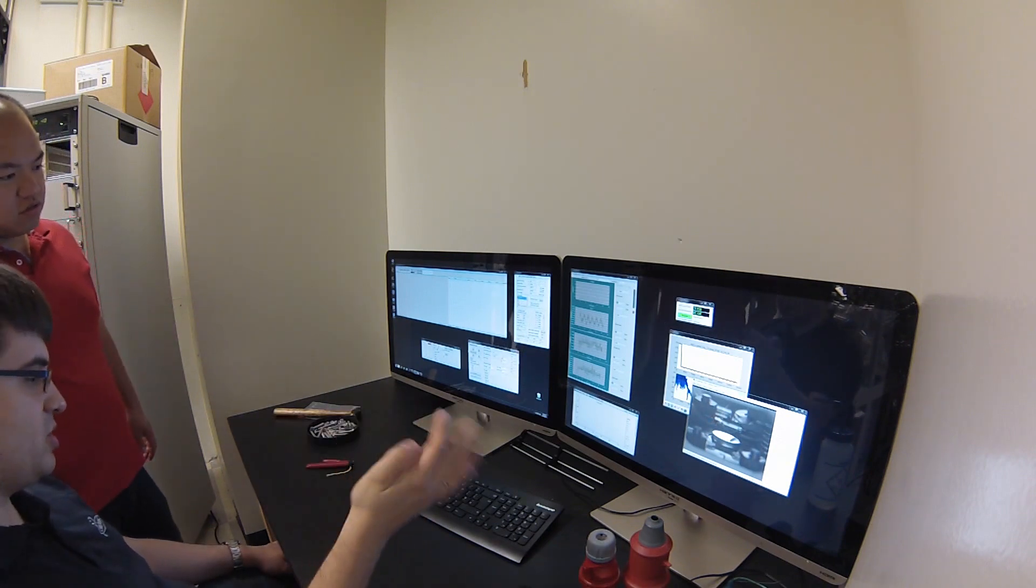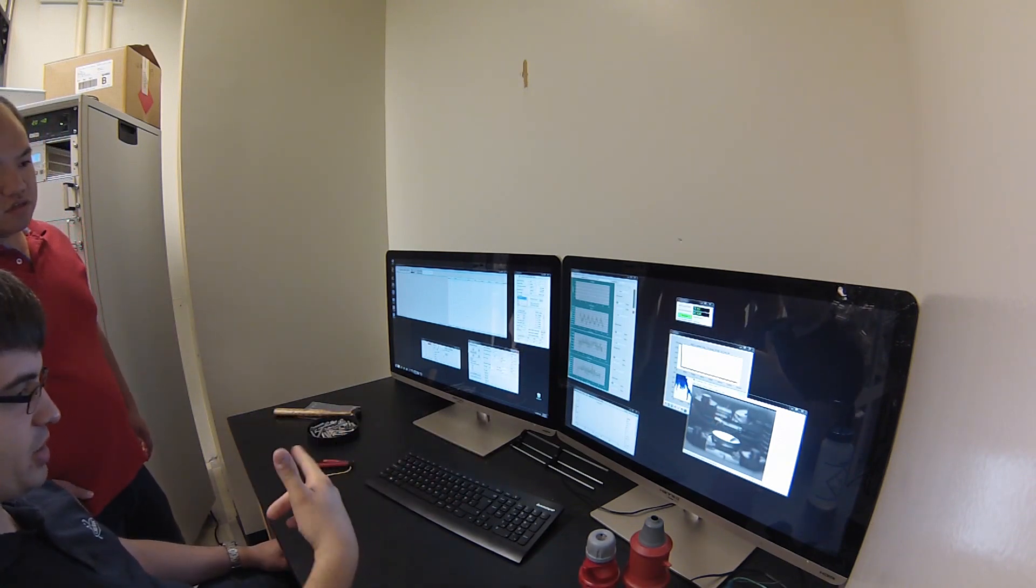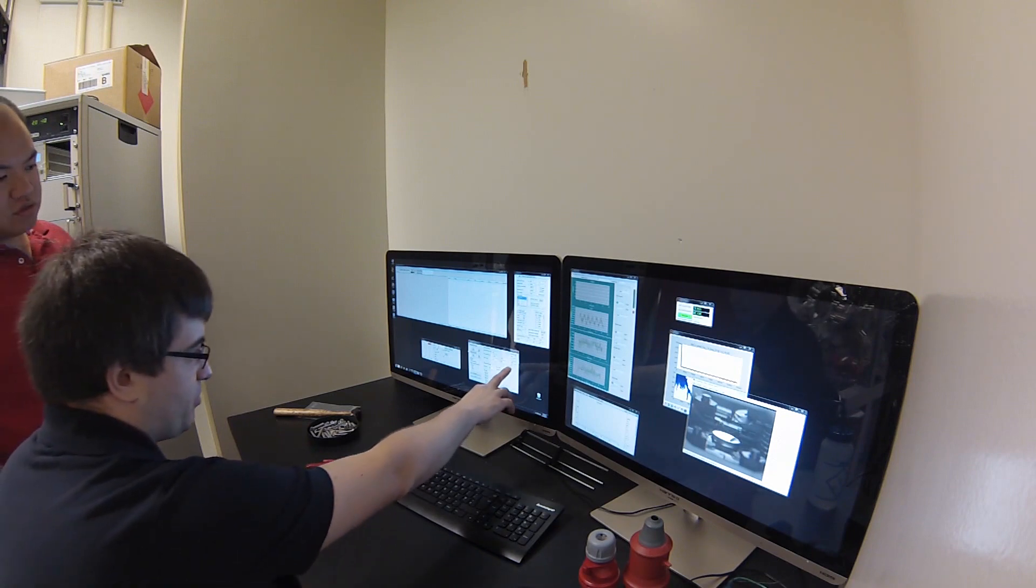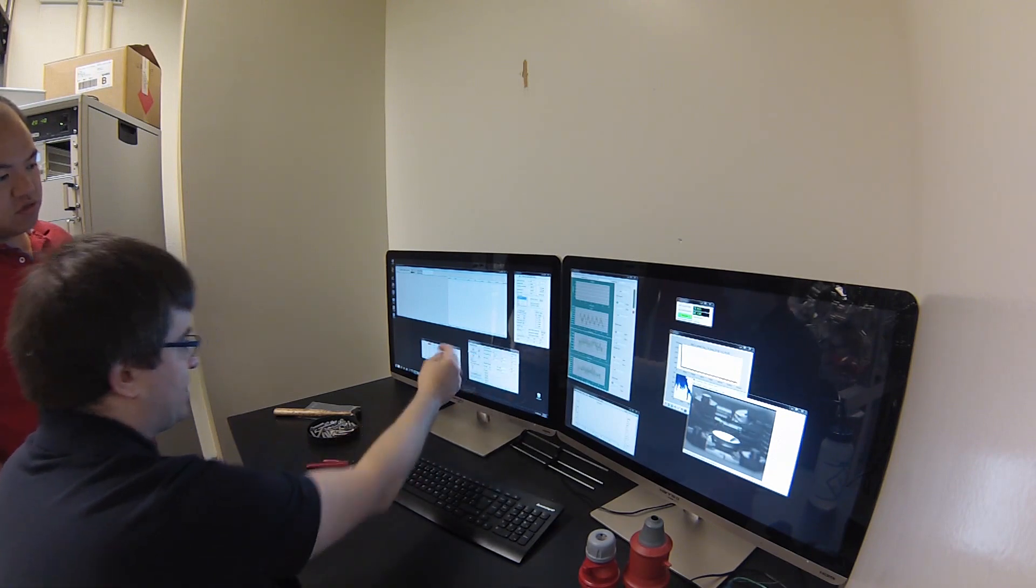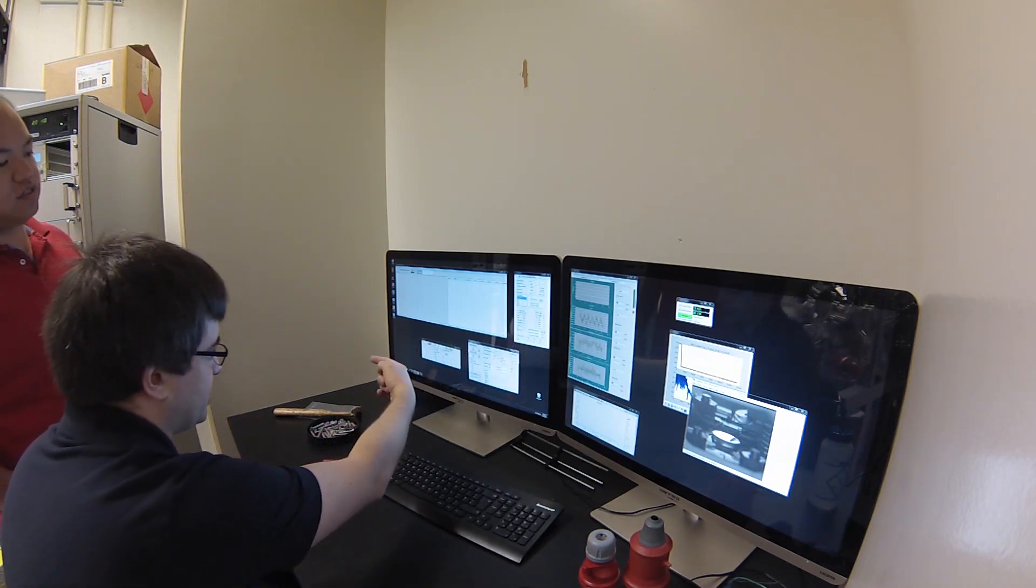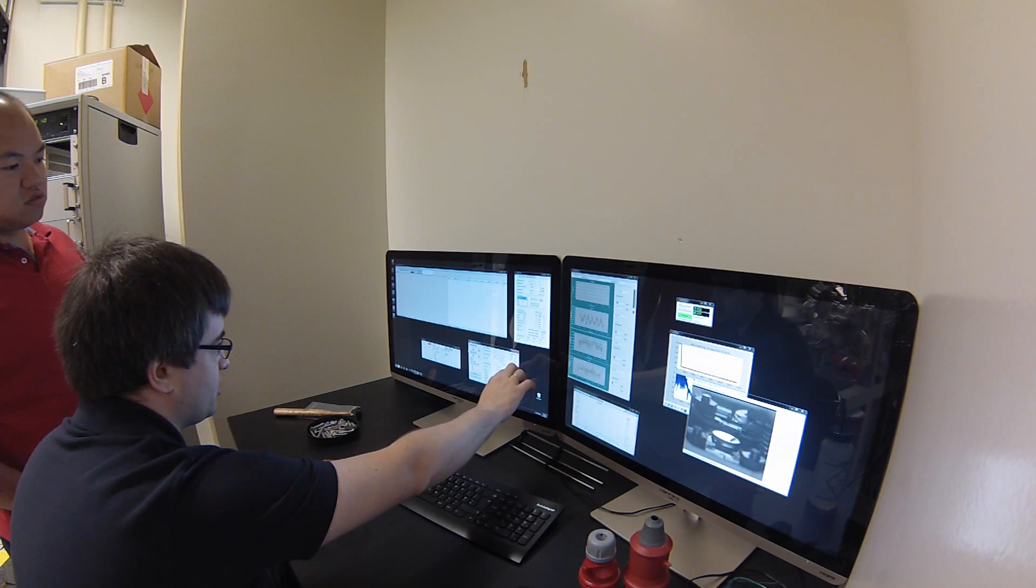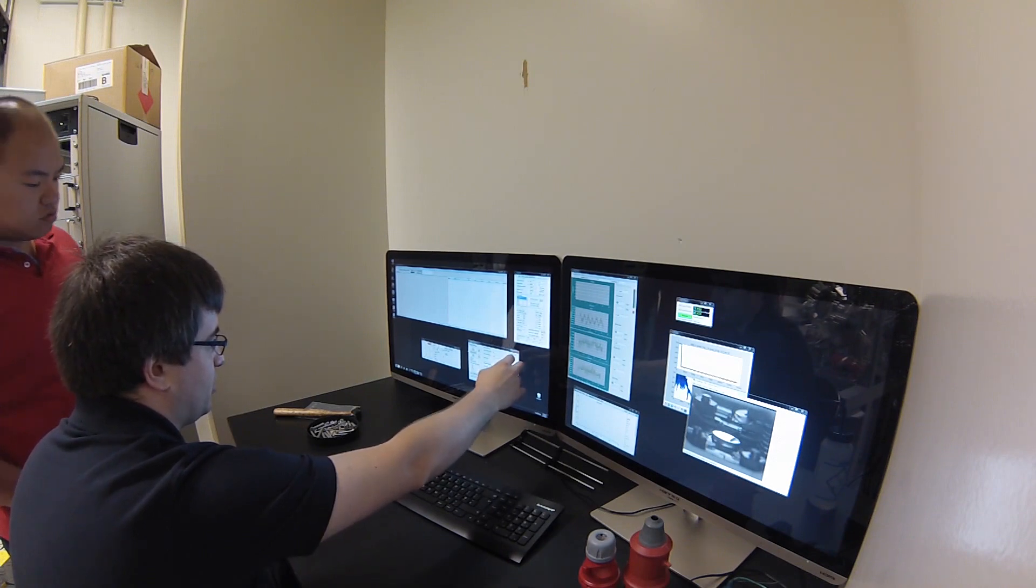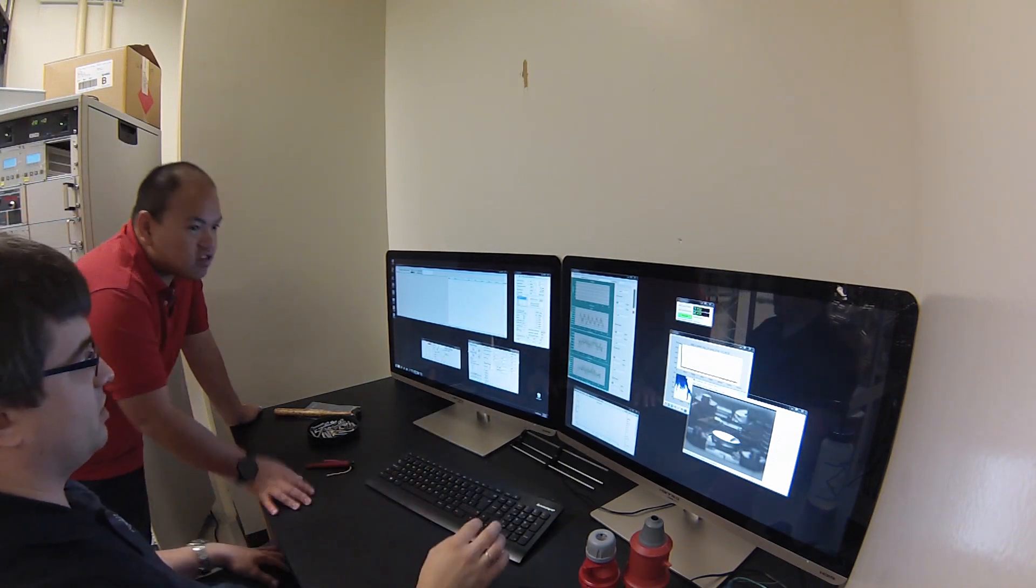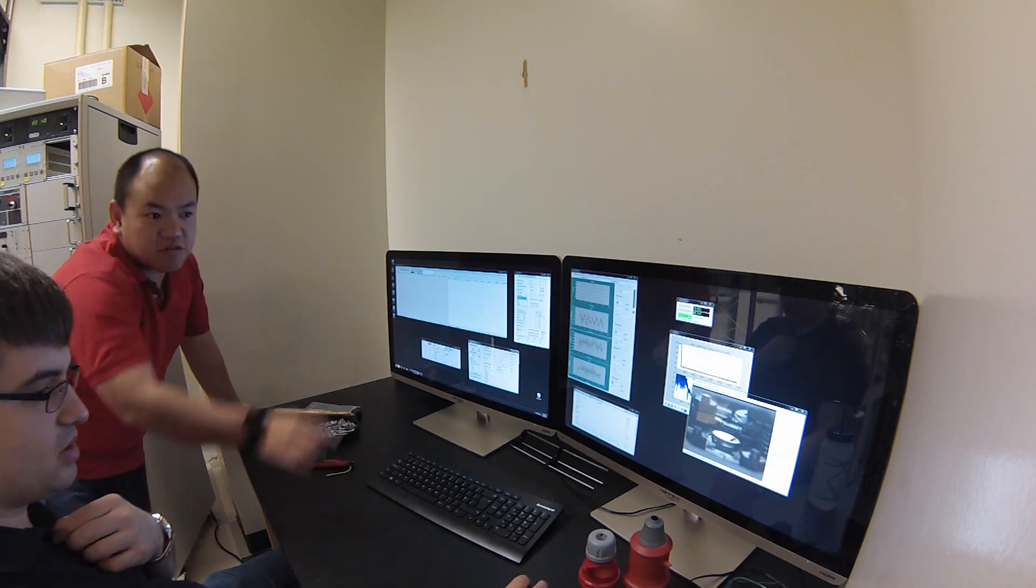I just found out which button is working in this direction. It was minus Y button but it has moved to the Y on the left. So I changed minus Y with X minus, and now all the motion is going to be the same as we can.